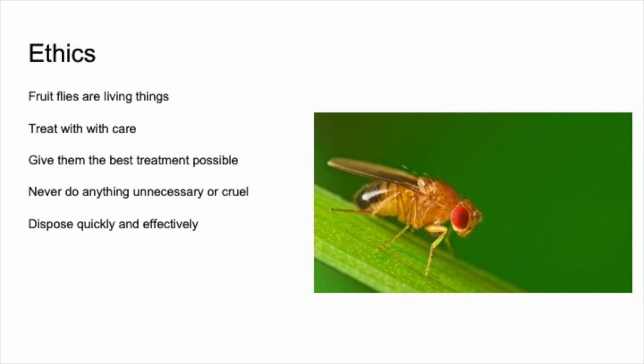But you shouldn't just take good care of them for the sake of science, although it's a huge factor. You should take care of them because they are living things and they deserve respect. So you should never do anything unnecessary or cruel to your flies. And you will need to dispose of a large number of flies throughout the process, but you want to make sure that they're disposed of quickly and effectively so you're not doing anything that will cause them to suffer for any length of time.